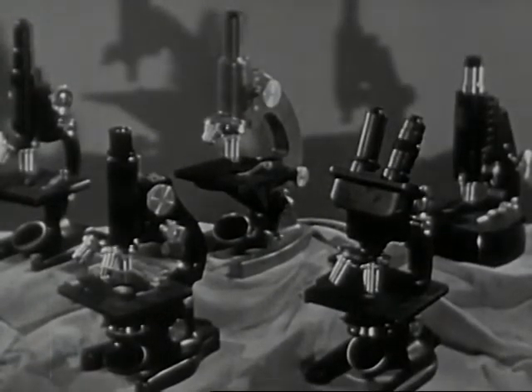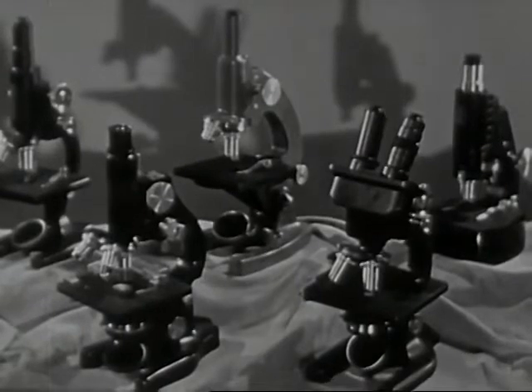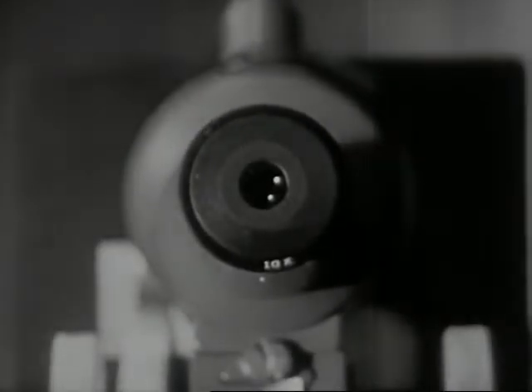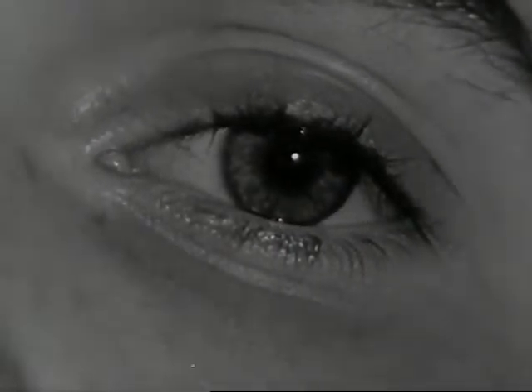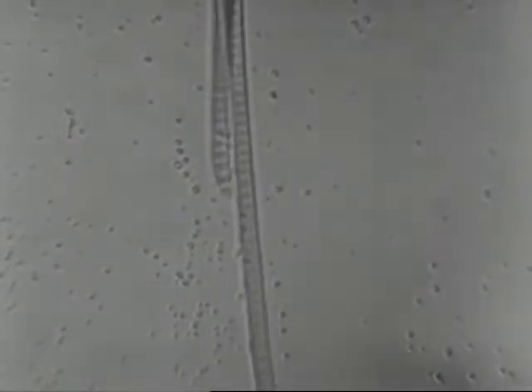There are many types of microscopes, some more elaborate than others, some made for special purposes. But essentially, they are all for the same purpose: to magnify plant and animal life and other matter of minute size to a degree that it may be studied. The powerful eye of the microscope extends the range of your eye when you use it correctly. The microscope is your window into the world we seldom see, a world of strange creatures.